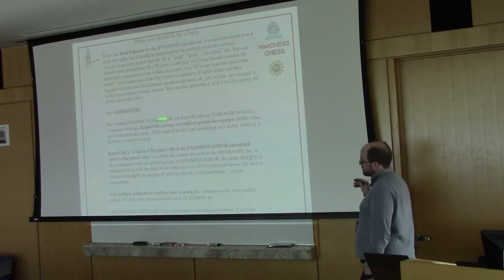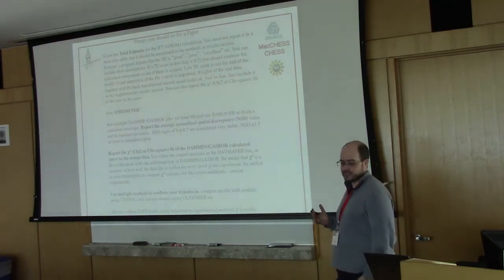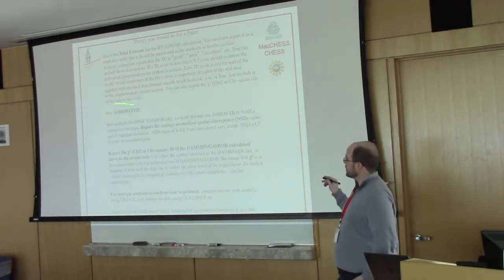AMBIMETER was already mentioned briefly, but determining whether or not your 3-dimensional reconstruction is any good is worth doing even before you do a 3-dimensional reconstruction. We'll talk about that in the tutorial tomorrow.